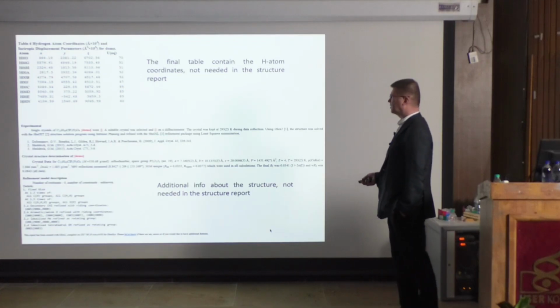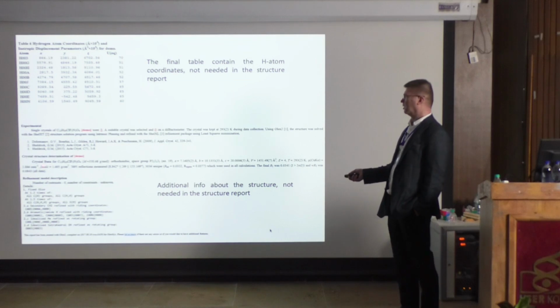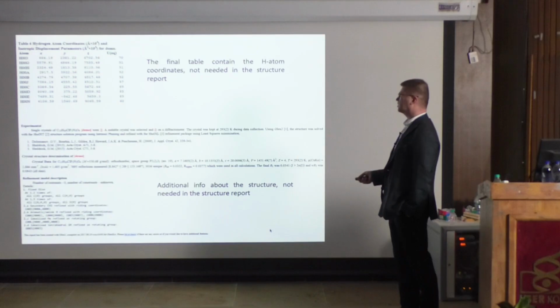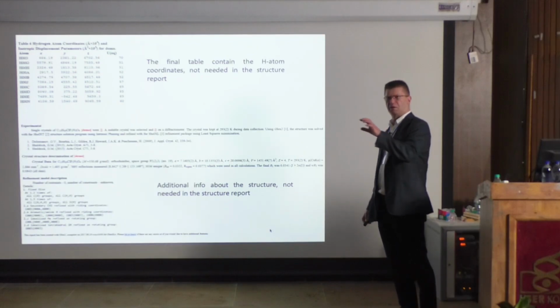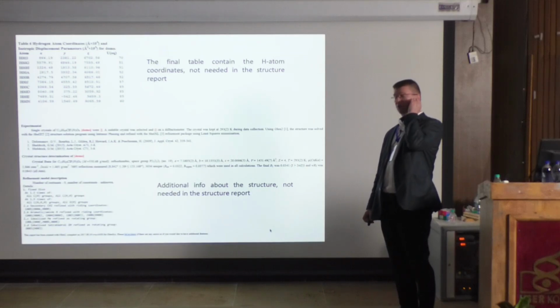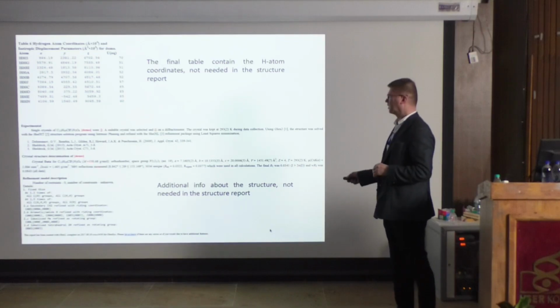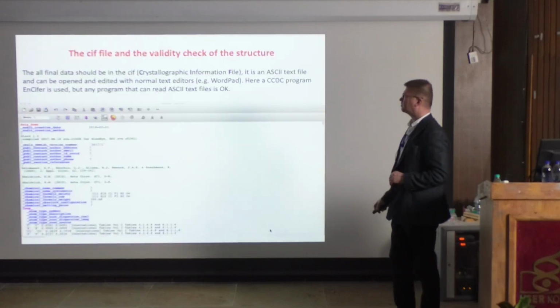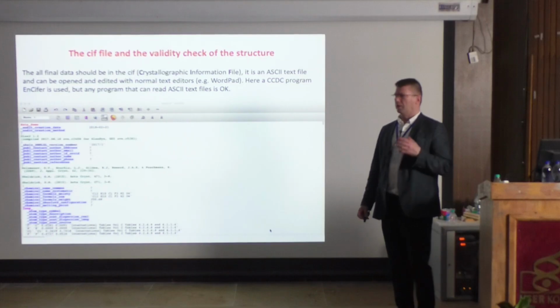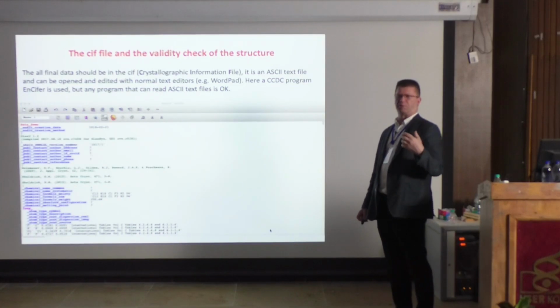Then this program makes a short additional summary, and you can actually use different versions of the data. You can see here, this is now the crystal data in this form. So it writes the same information chapter-wise, but the other was a table. So it's up to the person to always think about, okay, shall I make a table, or shall I write them chapter-wise? And that's the idea. So this is what the program prints as a report.